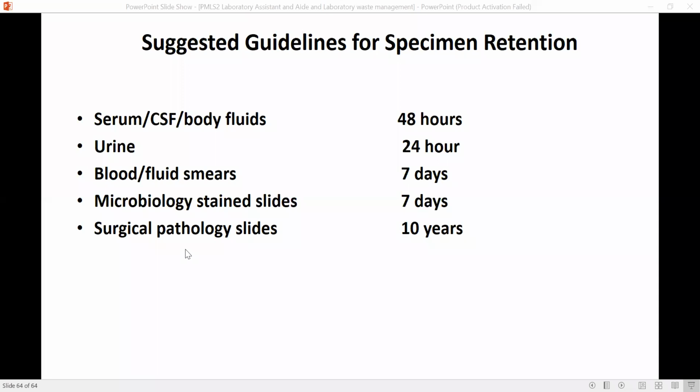Okay, yung surgical pathology slides, yung tinitingnan kung may cancer o wala. So usually 10 years before din-discard yan. So kasi usually may mga pathologists na chine-check, no? Nitingnan, kino-compare, ano ba siya? No? So nire-request, no? Nire-request siya. Okay, halimbawa, 'di ba? Ngayon, tinitingnan nila kung gaano kabilis mag-progress, no, yung kanyang cancer. So kino-compare. So wag muna itapon. No? So 10 years bago siya itapon.